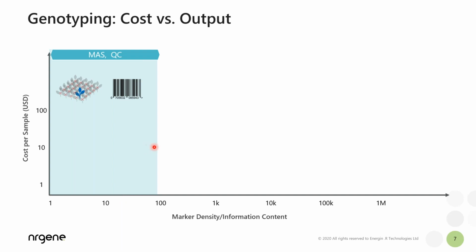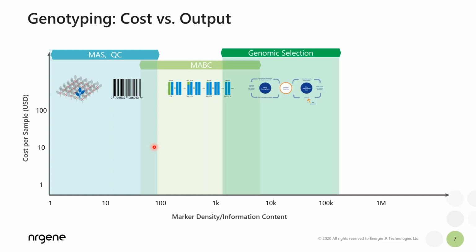It usually doesn't involve a lot of markers that are being put to use. Starting to increase in marker-assisted backcross, you need genome-wide representation of a low-density set of SNPs so that you can apply selection to reach a fully integrated individual within the shortest amount of time, or the fewest generations between introgression and achieving a new line.